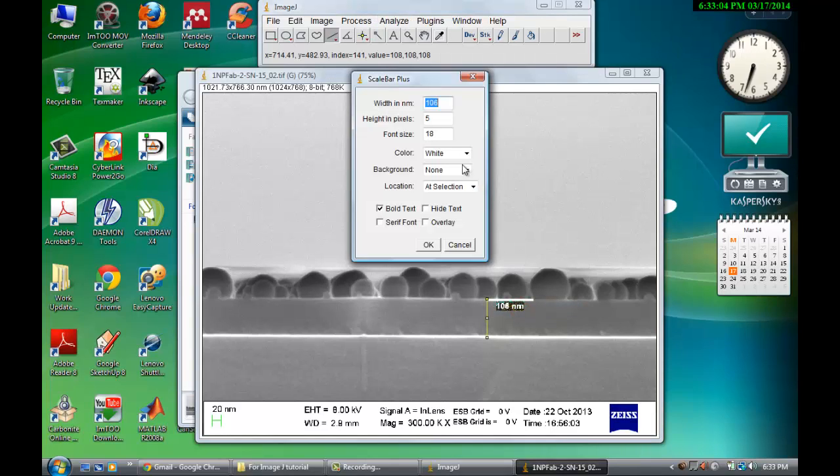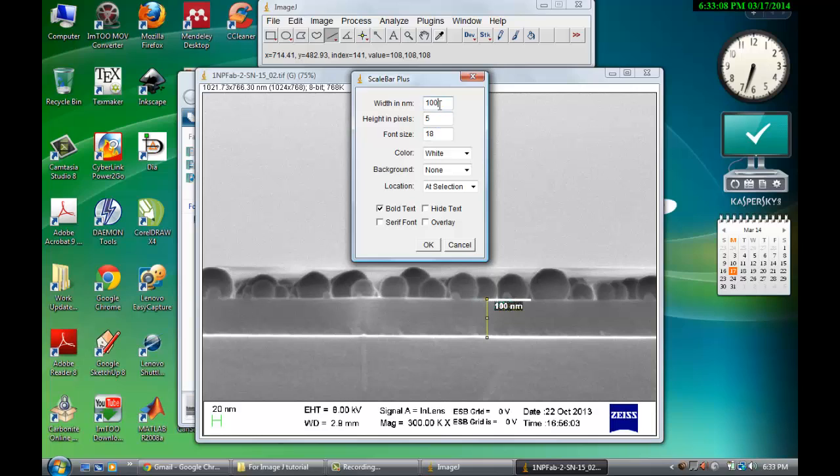So here once you open it, you can decide what distance you can make, 100 nanometer scale bar. You can increase the pixel height for that, about 20, 10, whatever.